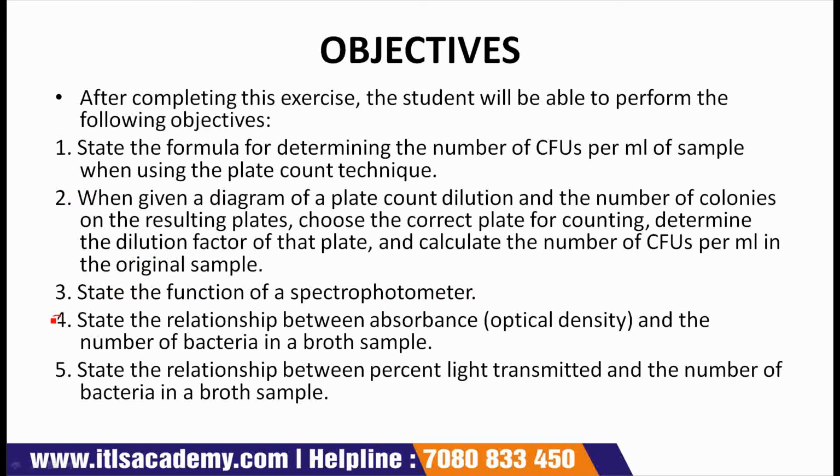Next objective of the test is, state the relationship between absorbance, that is optical density, and the number of bacteria in a broth sample. And the next objective is, state the relationship between percent light transmitted and the number of bacteria in a broth sample.